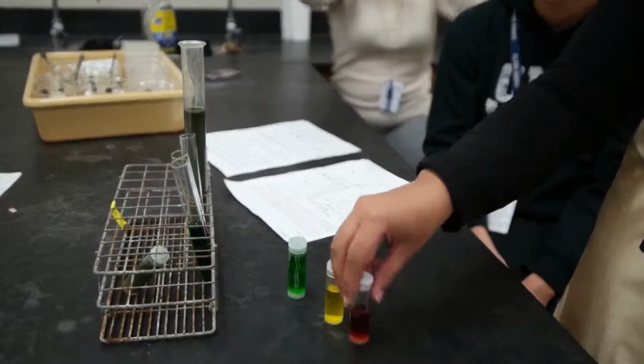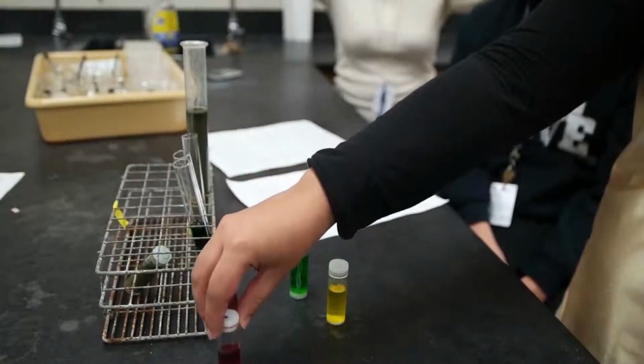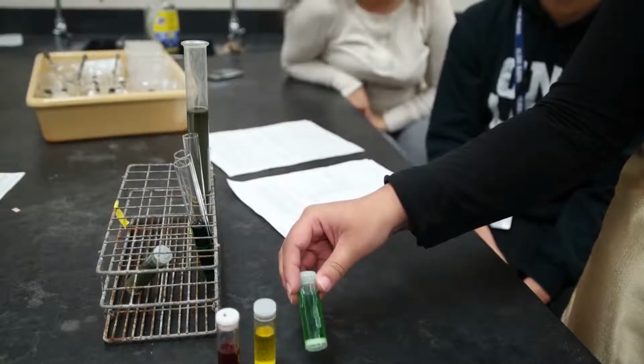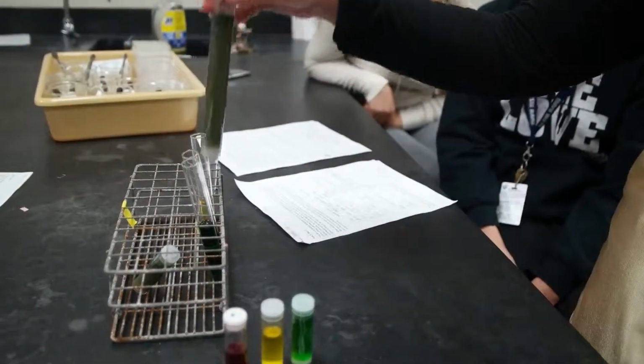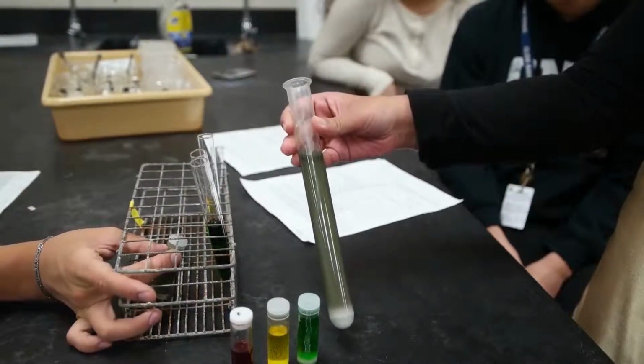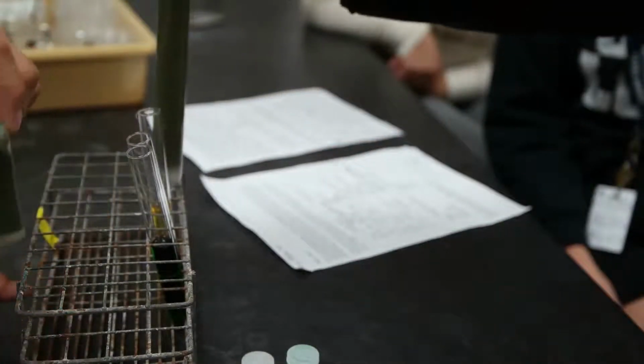Go. All right. So here we have different laboratory samples. This would be the blood of the dog, the sick dog. This is the urine of the sick dog. This is the vomit of the sick dog. And this would be the sample of feces from the sick dog. As you can see, the sample of feces is much larger than the other ones, and that's because the dog is not feeling well at all.